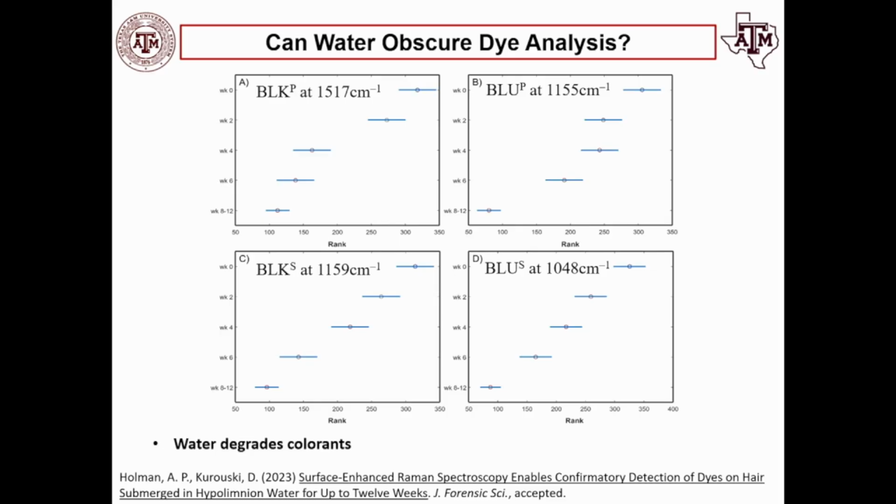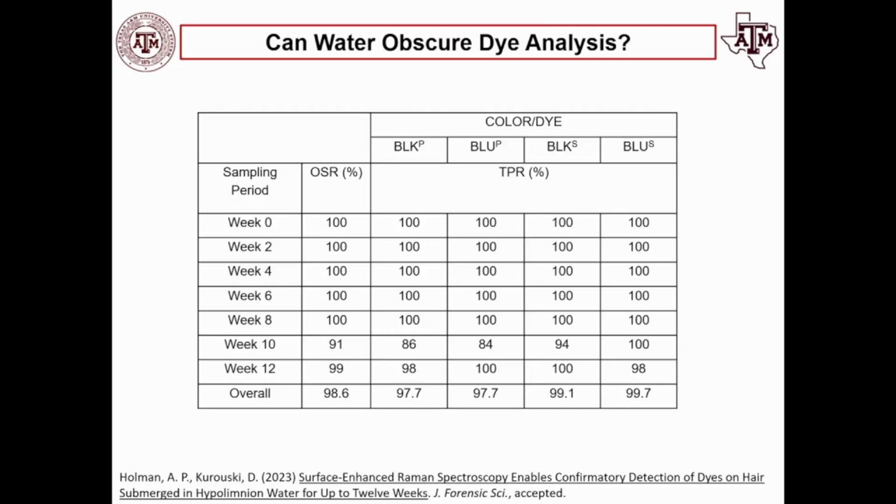And again, if we build a chemometric model, we have pretty good accuracy of identification of dyes based on the spectroscopic signatures that we acquired. So as you can see, it's critically important to perform experiments not only in the lab under clean and nice environments, but challenge ourselves and get the information about hair exposed to various environmental factors.